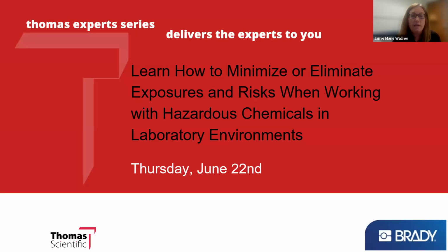But before you can have a lab that is safe for your employees, we need to identify our safety needs on all areas of the lab process: procurement, storage, waste, test room, in-process lab.